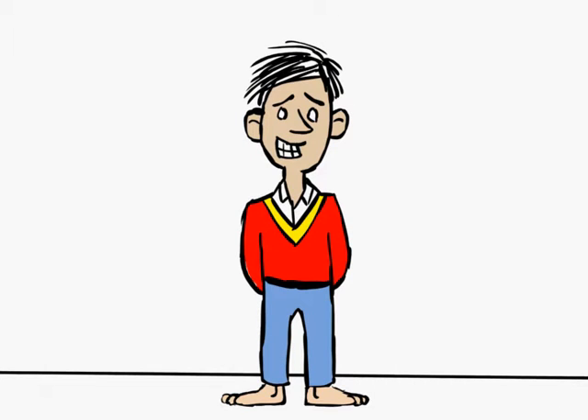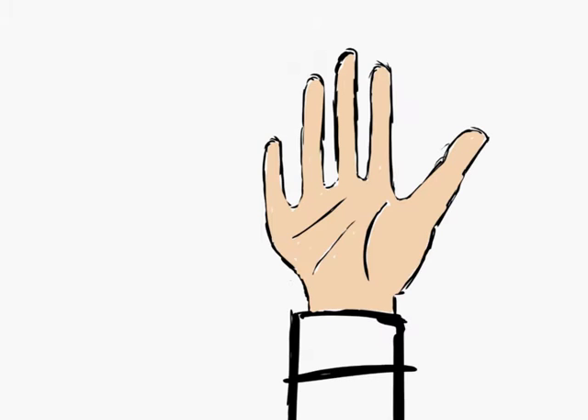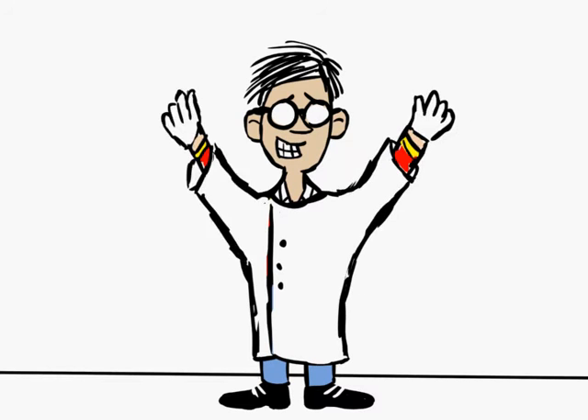This young fella here needs to wear goggles, lab coat, enclosed shoes, and gloves. That's better. Now we're ready. Let's see how he goes.